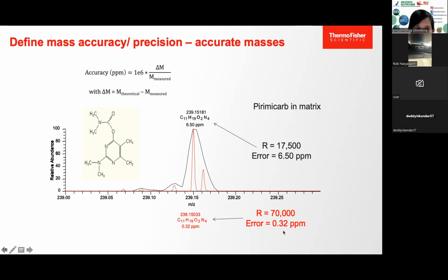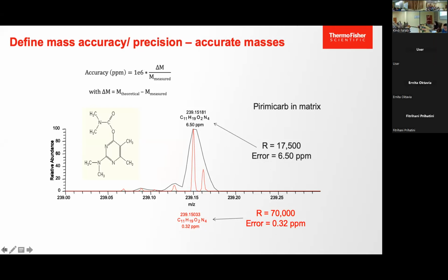So what I'm showing now is a forward analysis. You have the formula, it gives you the mass. The later part of the analysis, what is relevant to you on natural product, you are doing the reverse way. You have the masses, you need to derive the chemical formula. That's the challenge for natural product and organic synthesis. Okay, so which result do you want? You want the accurate one or the other one? Of course, you want the accurate one.